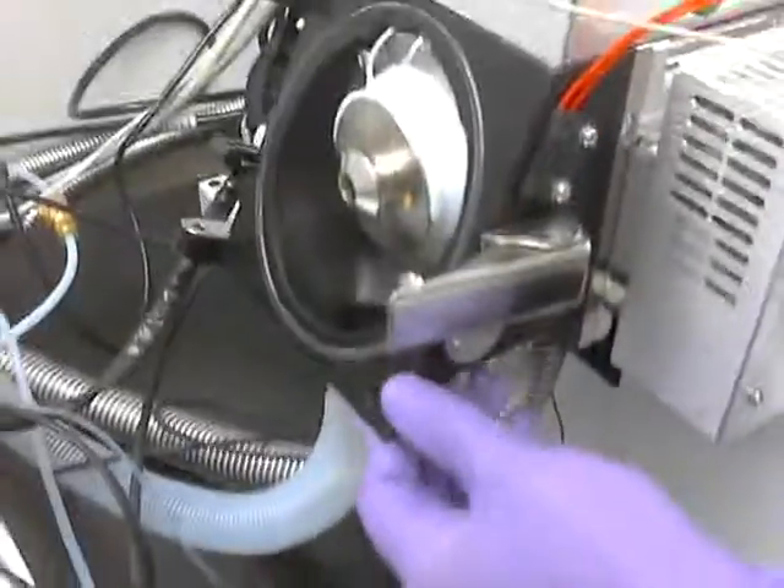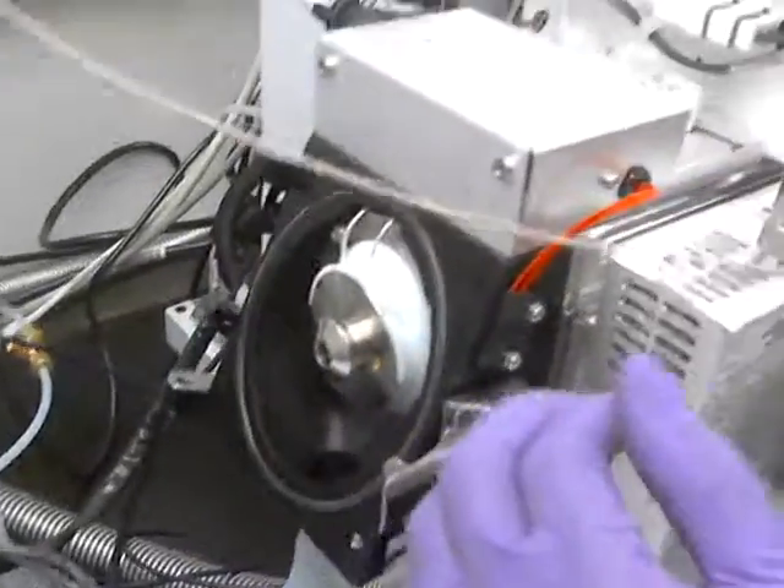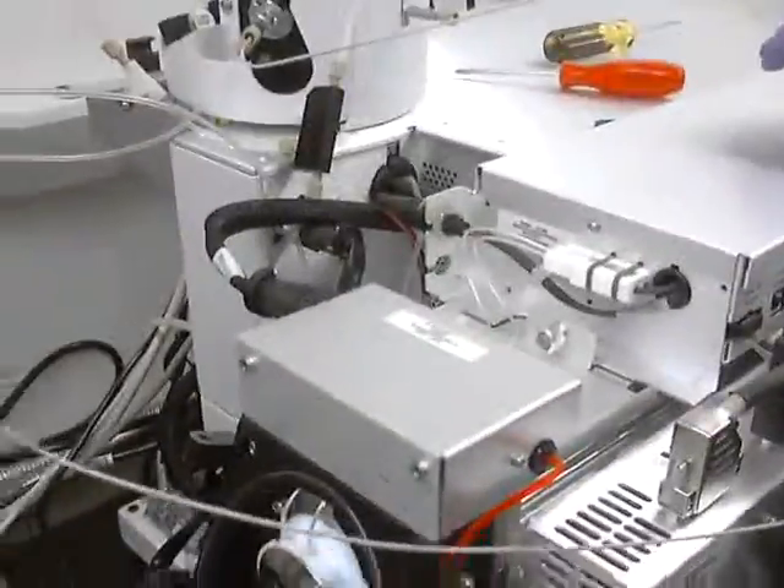Now make sure all those screws are in place — all the connectors, all these guys here. I think we're good to go. Thank you.